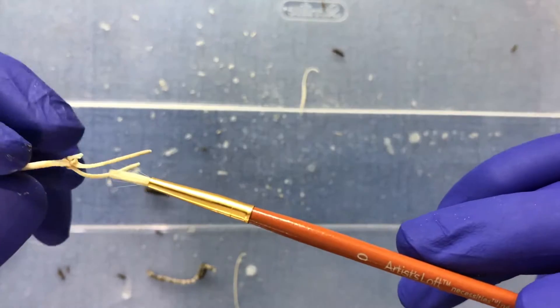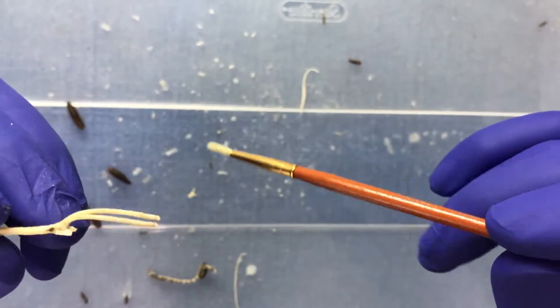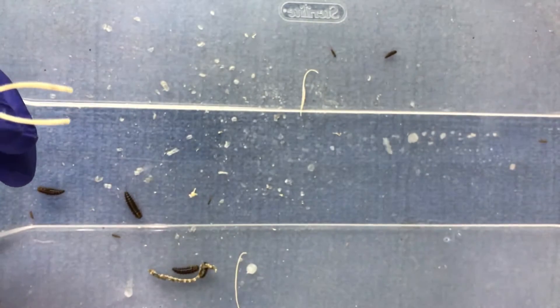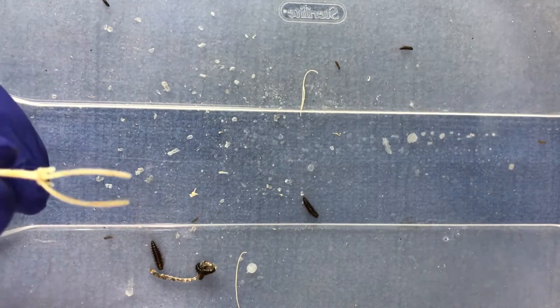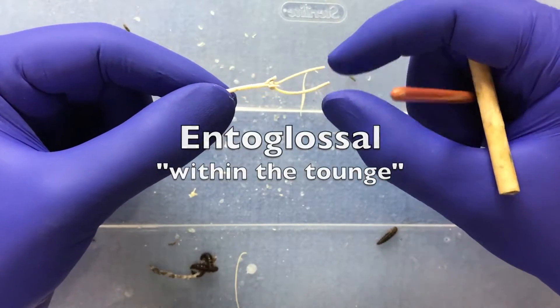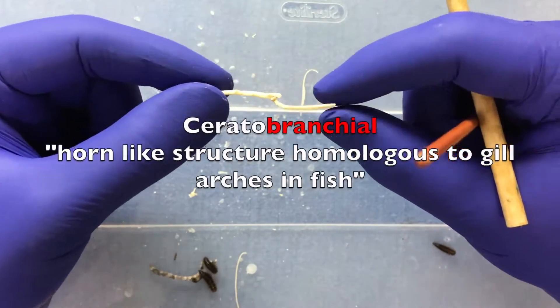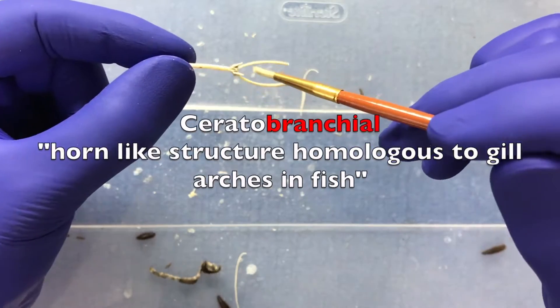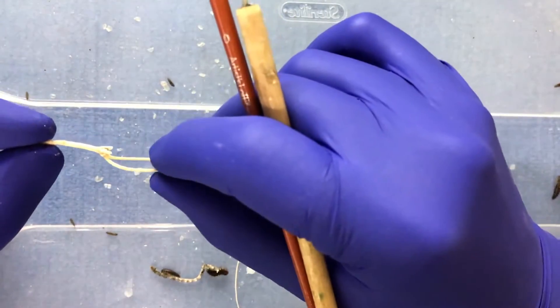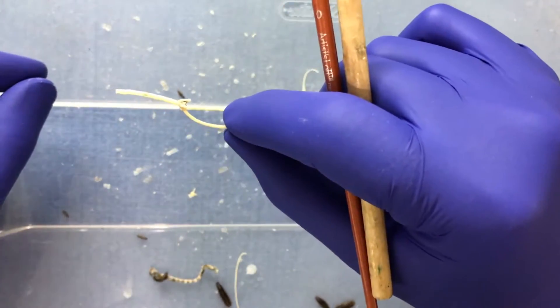It's nice to save some of the cartilaginous structures. This is the entoglossal and ceratoglossal complex that makes up the tongue projection system — the hard part of the tongue projection system in the chameleon. It's pretty rad.